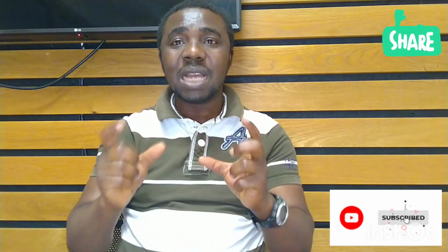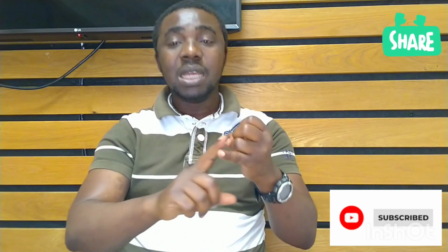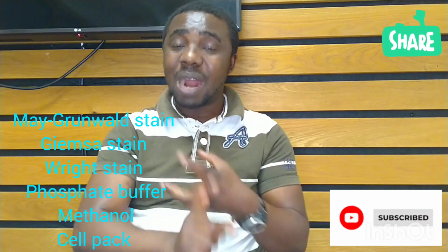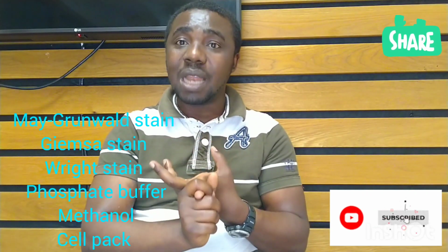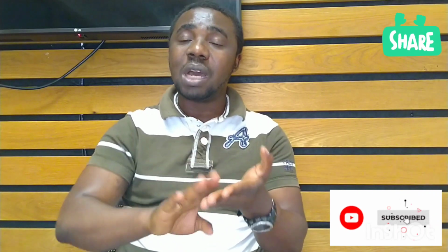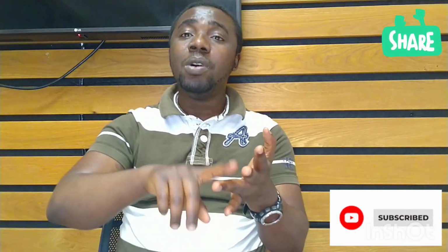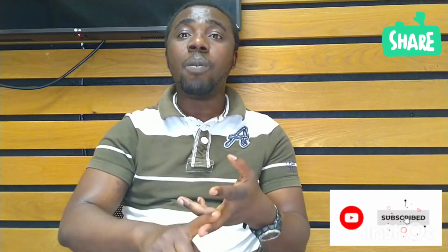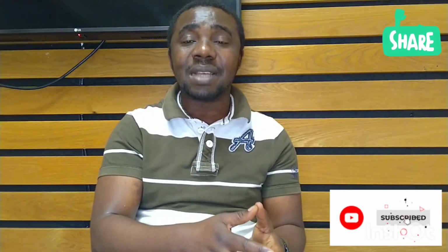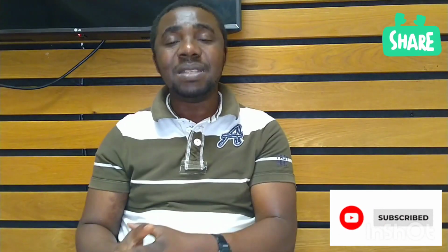But what I want you to get here is that the SP10 uses Giemsa, it uses May-Grunwald, and some of them use Wright stain. Then you have something like methanol. So you now know the functions of each one of them. I'm trying to tell you that both May-Grunwald and Giemsa are all forms of Romanowsky stain, which can stain the acidic content of the cell and also the basic content of the cell.